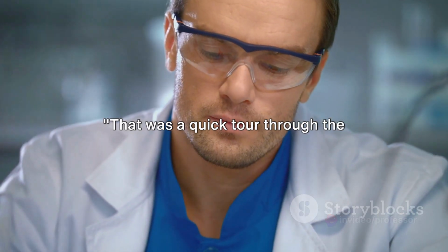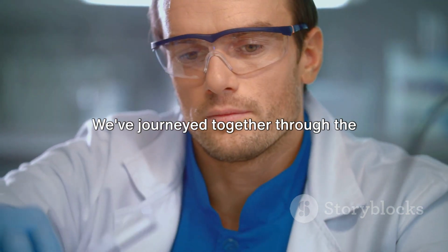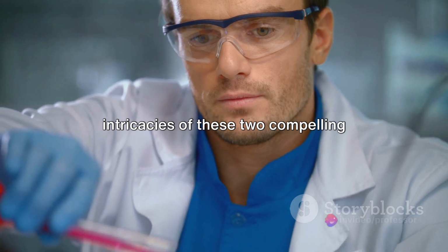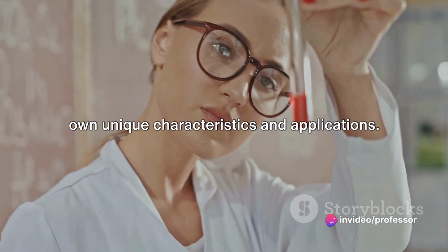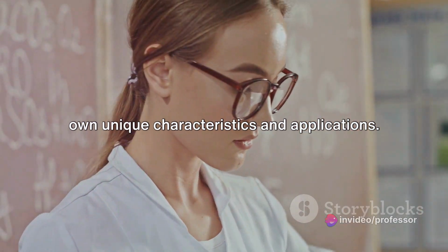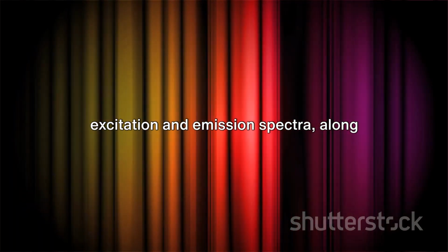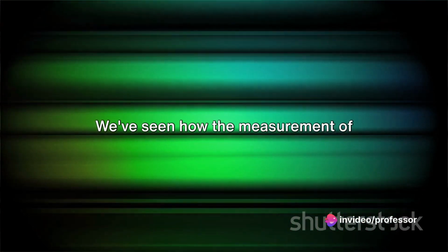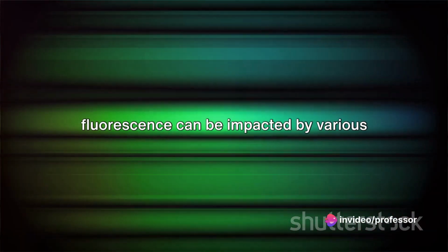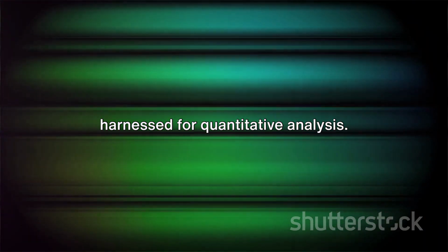That was a quick tour through the fascinating world of fluorimetry and phosphorimetry. We've journeyed together through the intricacies of these two compelling spectroscopic techniques, each with its own unique characteristics and applications. In our exploration of fluorimetry, we delved into the captivating phenomena of excitation and emission spectra, along with the quantum world of molecular luminescence. We've seen how the measurement of fluorescence can be impacted by various factors and how this knowledge can be harnessed for quantitative analysis.